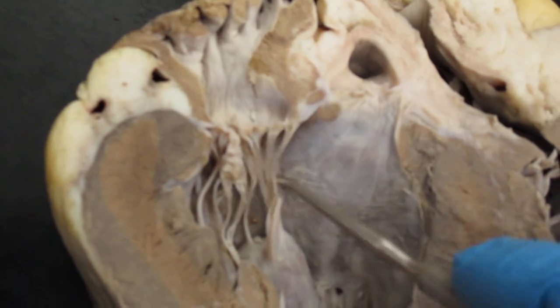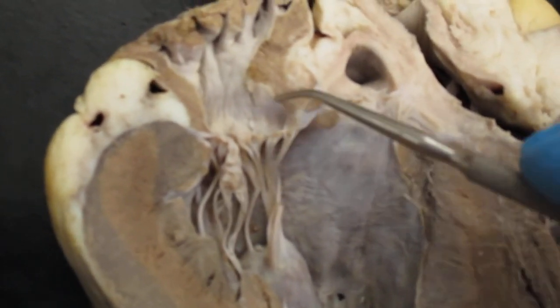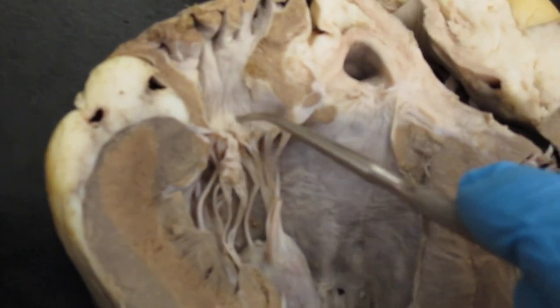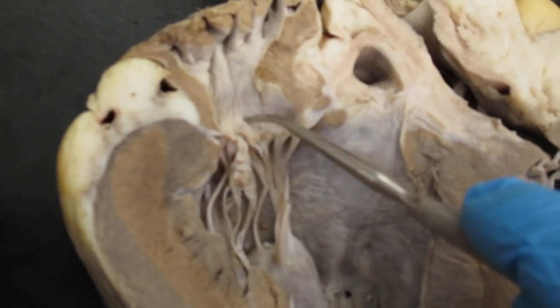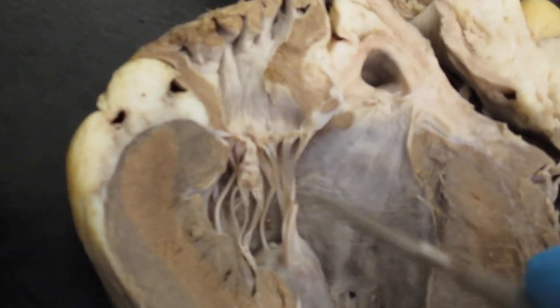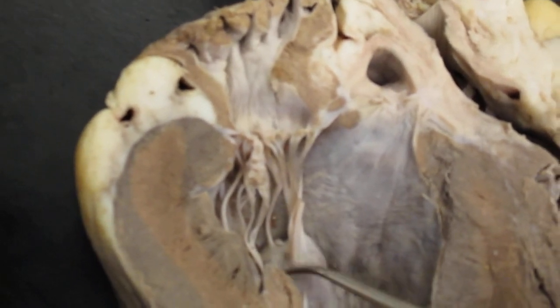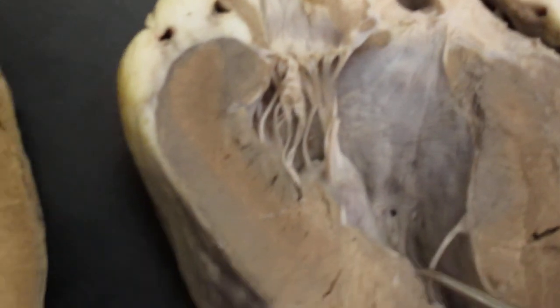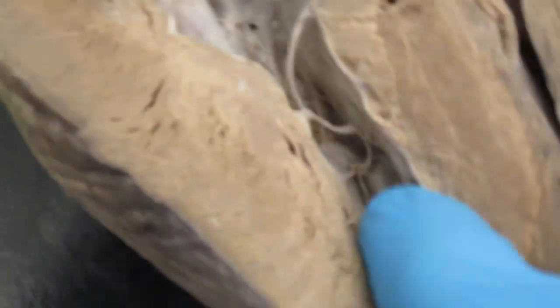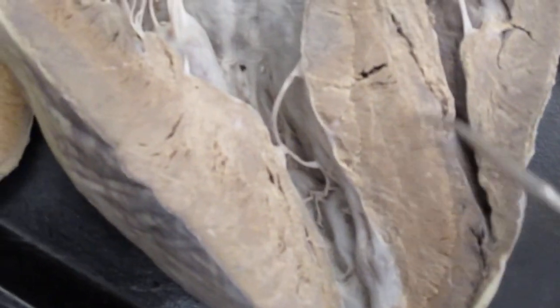The chordae tendineae look like guitar strings or guy wires, and they connect the cusps of the bicuspid valve to the papillary muscles. And then right here you would have your trabeculae carneae and the anterior interventricular septum.